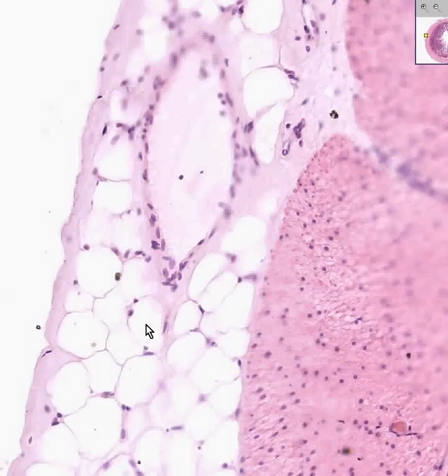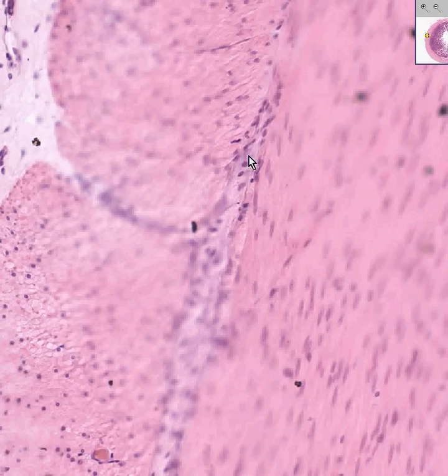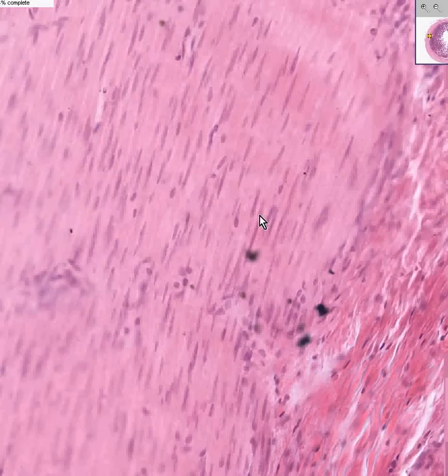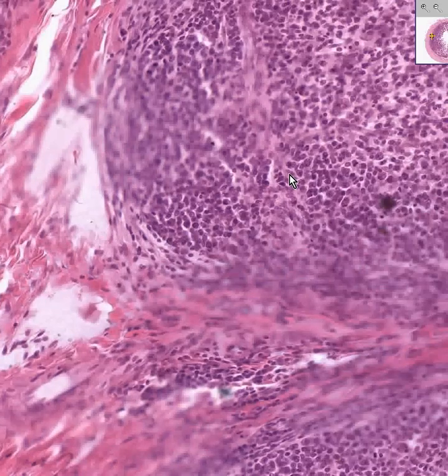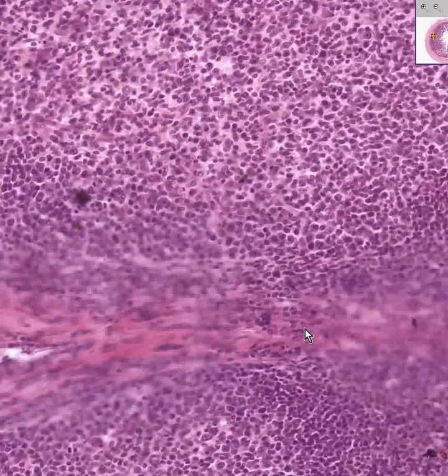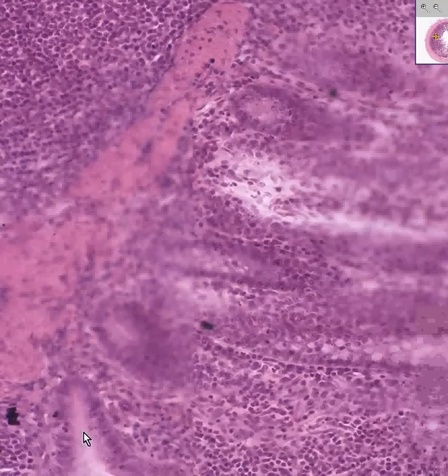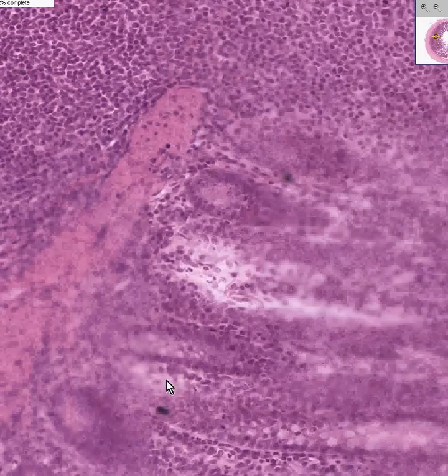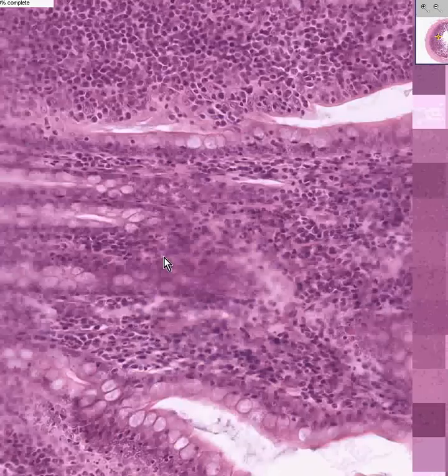Let's go back in: mesothelial cells, serosa, serosal connective tissue, outer longitudinal muscle fibers, probably a couple of nerve cells in the myenteric plexus, circular spindly arranged smooth muscle, submucosal connective tissue, blood vessels in the submucosa — there's an artery, there's probably a vein. There's some lymphoid tissue; whenever you get a lot of lymphoid tissue you're probably in the ileum rather than the jejunum. There's an extension of submucosal connective tissue possibly forming a plica circularis (P-L-I-C-A circularis), which increases the mucosal surface area. This is the mucosa now — you can see the glands, the lamina propria, and a few smooth muscle bundles of the muscularis mucosae.